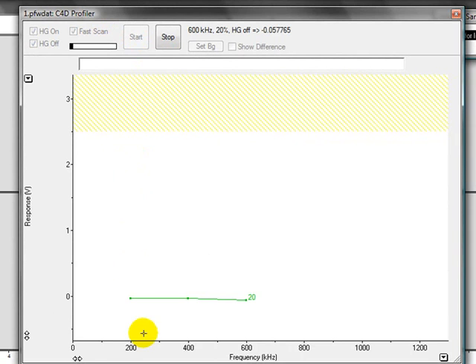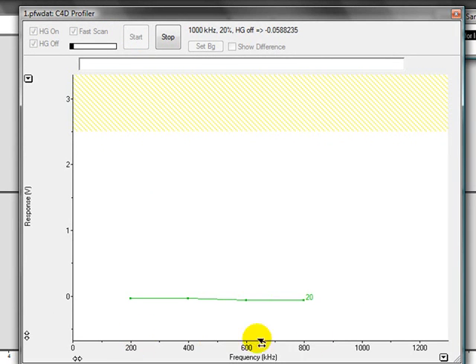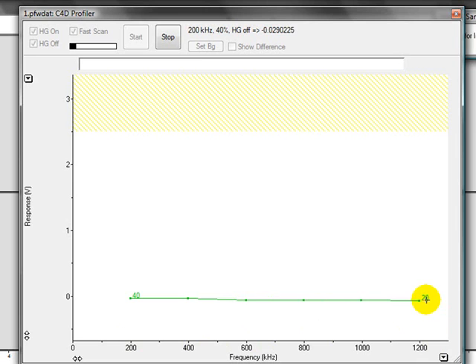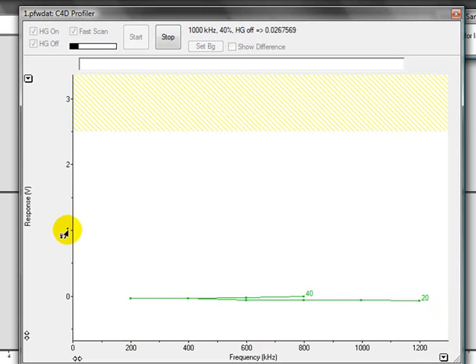What the software is doing is testing different frequencies at different amplitudes. It is starting at 20%, now it is 40%, and it is recording the detector's response.